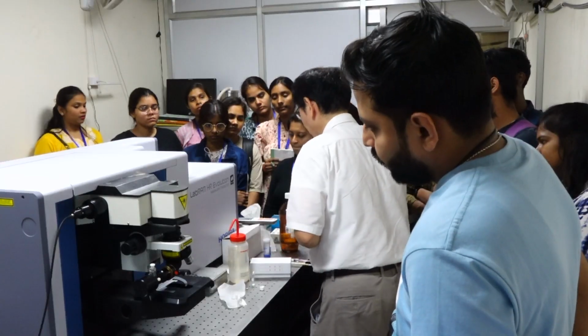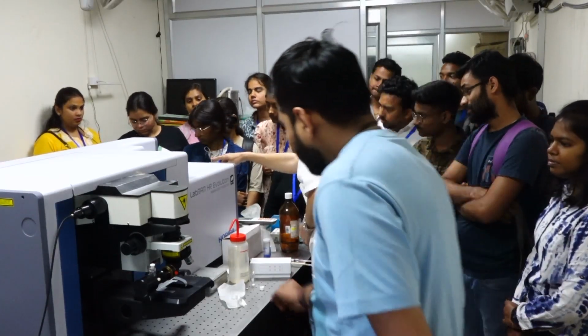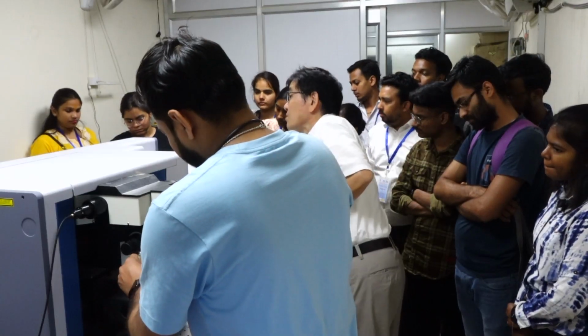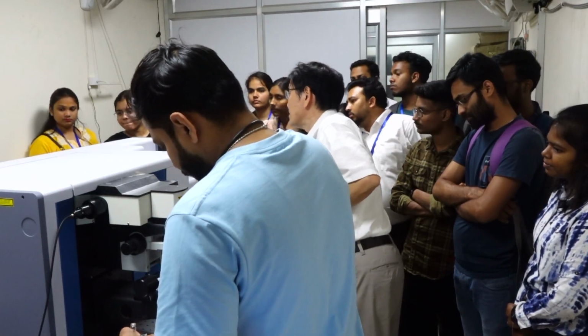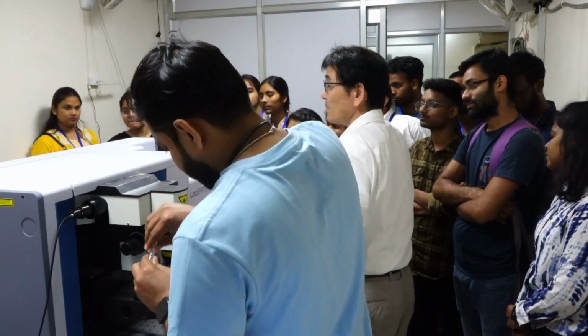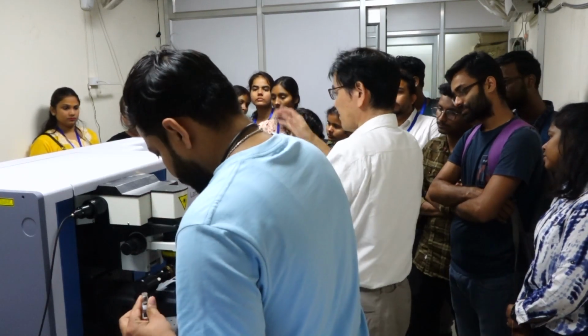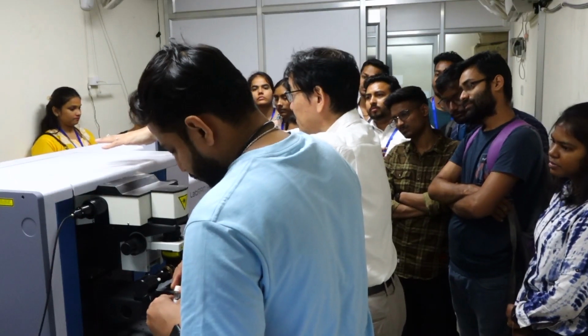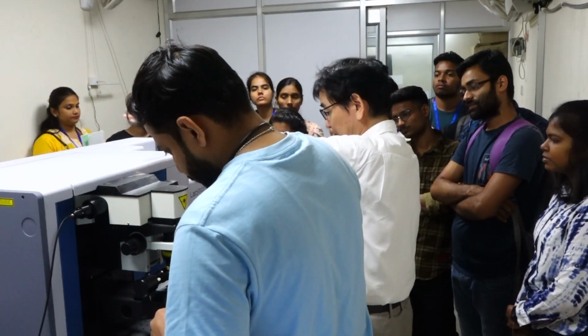So for safety, the laser beam goes through the optical fiber and it is introduced into this equipment. Probably you see over there. So laser beam comes into this box. And sample point is here.